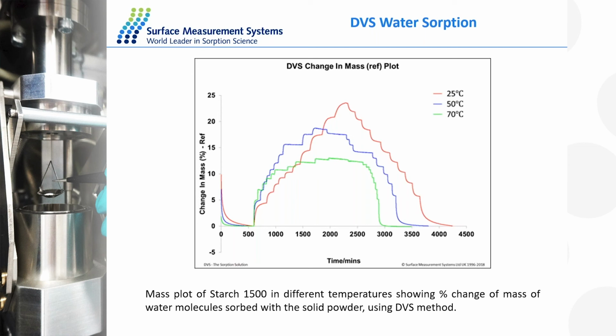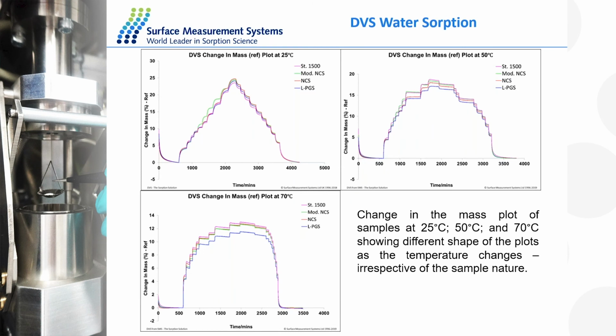With the other samples, yeah, you're right. The effect is less, and the uptakes are more similar at different temperatures, and that's because the material basically hardens after exposure to humidity. These are the more fully gelatinized samples, and with the initial gelatinization, the effect of moisture has already taken place and the material has hardened, and that affects the uptake of the material as well.